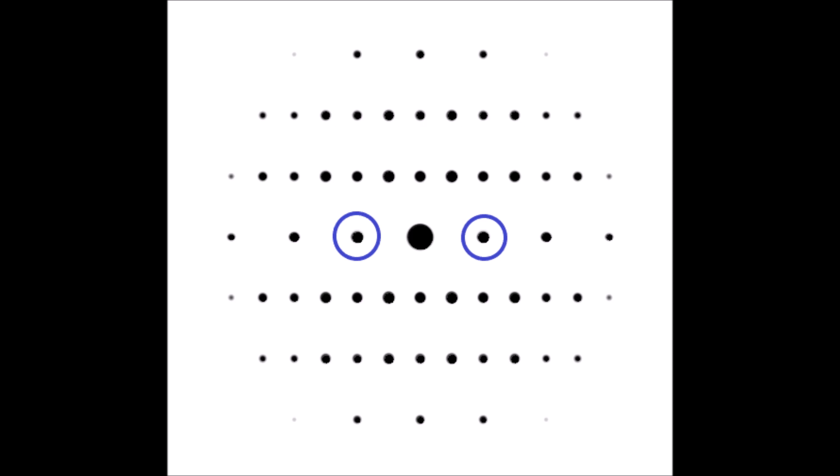So in the schematic I have here, you can see I have two spots circled. I have a Bragg spot and its opposite. You could take the right one to be the spot and the left to be its opposite or vice versa, it doesn't matter.